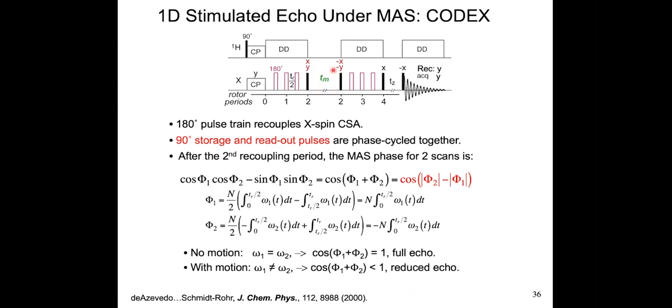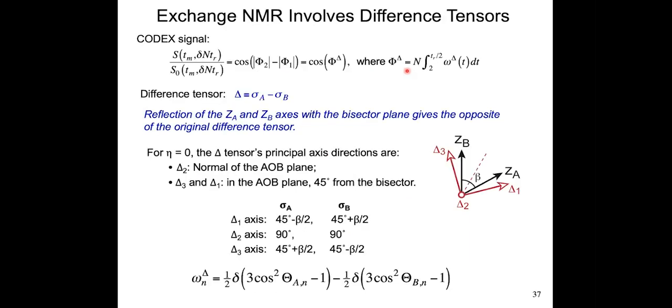That can be quite significant as you're waiting for hundreds of milliseconds here. So that needs to be taken care of. And the way to do that is to switch the TM and TZ, put a short TZ in the front so that there's no chance for the molecules to move, very short, 1 millisecond. And then the second one being long. So between the two experiments, you have the same combined TM and TZ. So then they get the same T1 relaxation time, you factor that out.